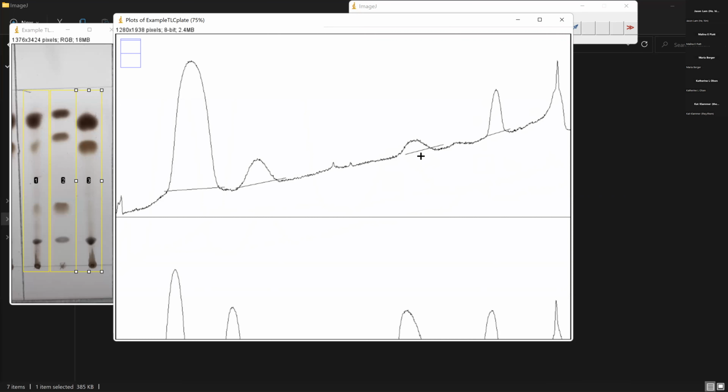If that happens, we'll try to work with you to figure out a way, but hopefully we can figure it out. So I'm going to go ahead and get the area for that. You only need to find the areas for each of the compounds for the HDL and for the pellet. You do not need to find it for the standards.